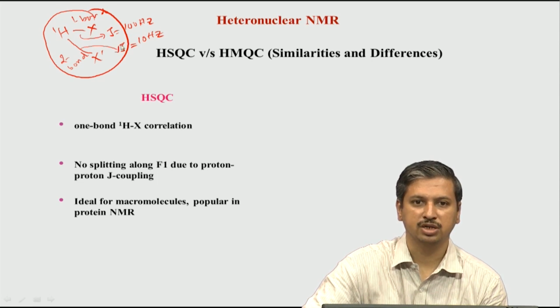So, this whole process is exactly what we do in HSQC and HMQC as well as HMBC. We will come to HMBC in a short while. The idea in HMBC, called heteronuclear multiple bond correlation, is that we go to more than one bond, and in that experiment we suppress the direct one bond correlation.